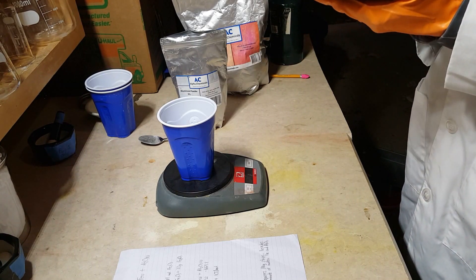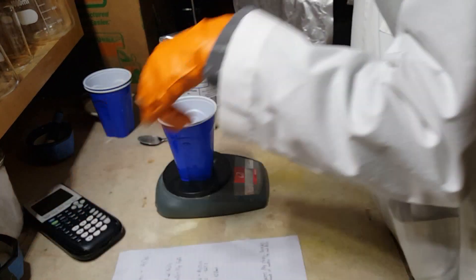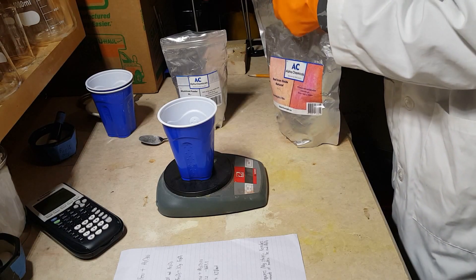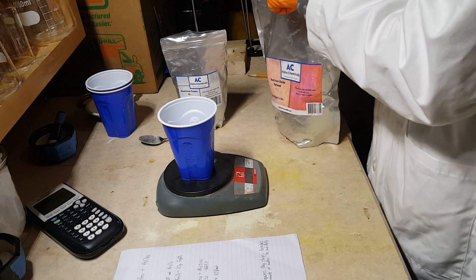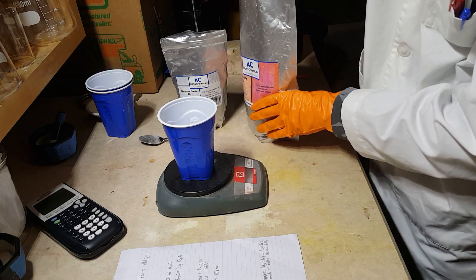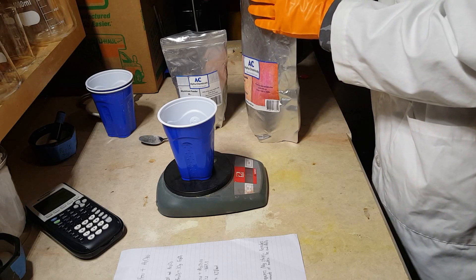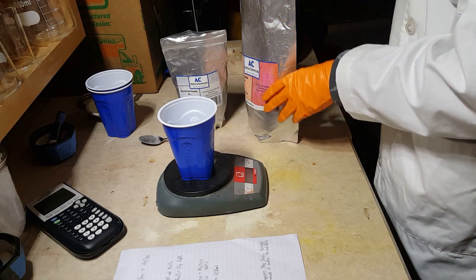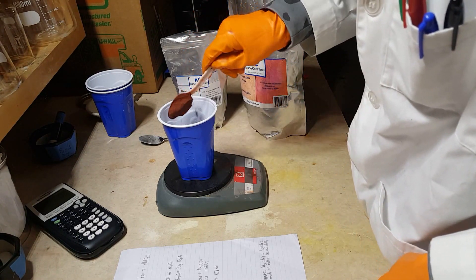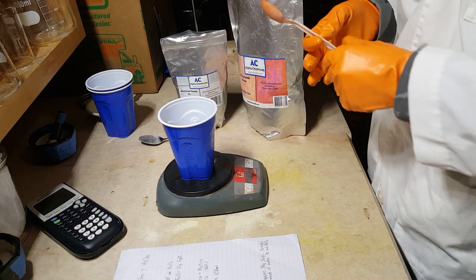So in total our mixture will weigh 54.4 grams. Let's add the iron oxide. Now, this stuff is just common rust. You'll find it on the side of buildings, on your pipes, on anything that contains iron. Iron reacts very readily with oxygen. The bond between aluminum and oxygen is more stable than the bond between iron and oxygen, so aluminum is capable of ripping the oxygen away from the iron and releasing huge amounts of energy stored in the iron-oxygen bond.